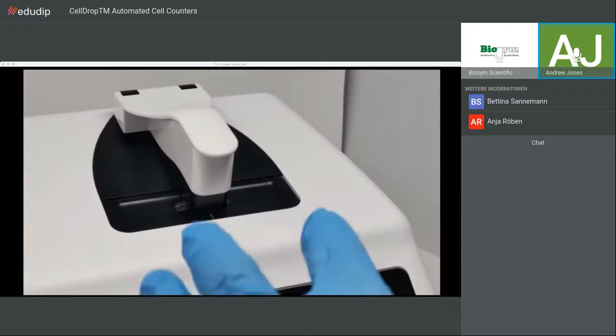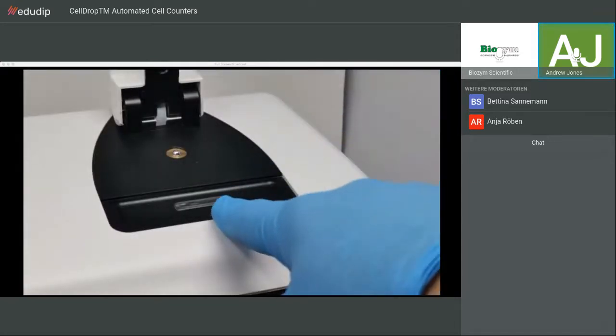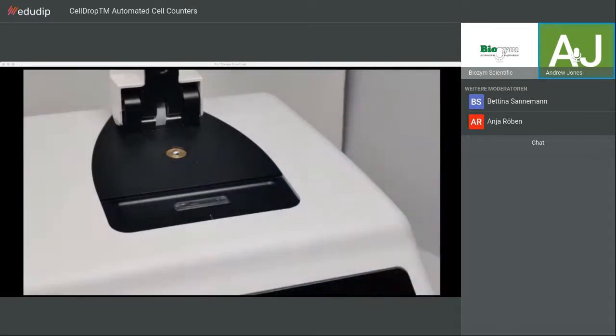Okay, so if we look at the top here, this is where we would normally pipette our sample, but around our measurement surface, you'll see a slide-shaped cutout. So if particular samples need to be contained, you can just use disposable slides for those. And we just set it in the protocol. We set it to slide rather than direct pipette. It takes 2 seconds to do. So if you have hazardous samples, you can either use a disposable slide, or this can be situated in a flow hood.